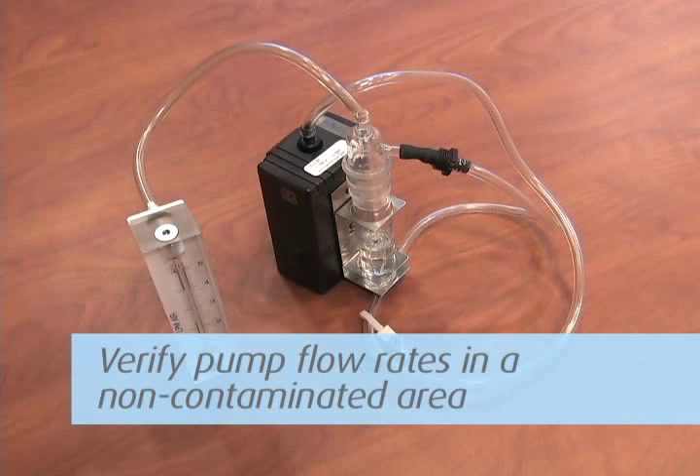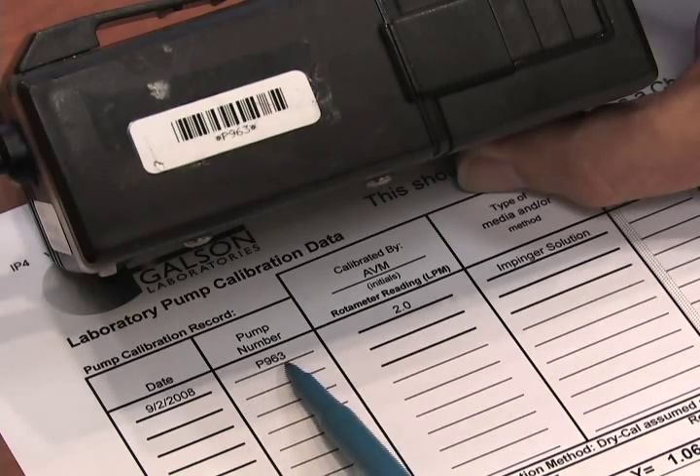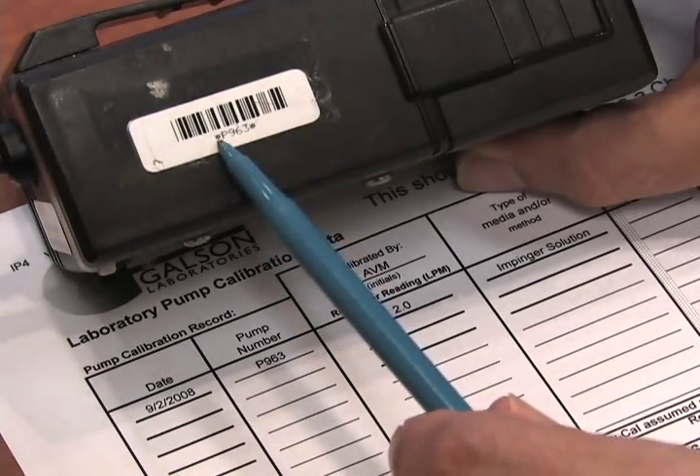Be sure to verify the pump flow rates in an area where you are not exposing the media and equipment to the contaminant, like an office setting. All pumps have the lab calibration information on the lab pump calibration data sheet provided.